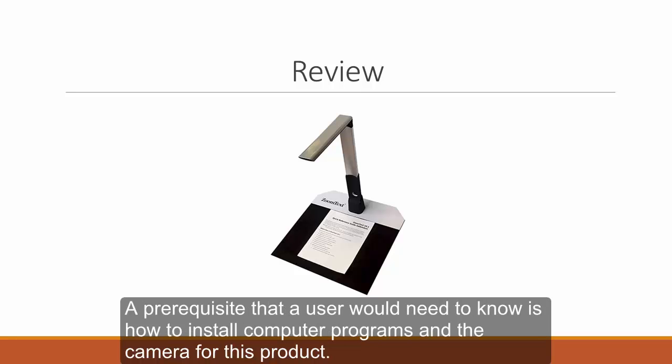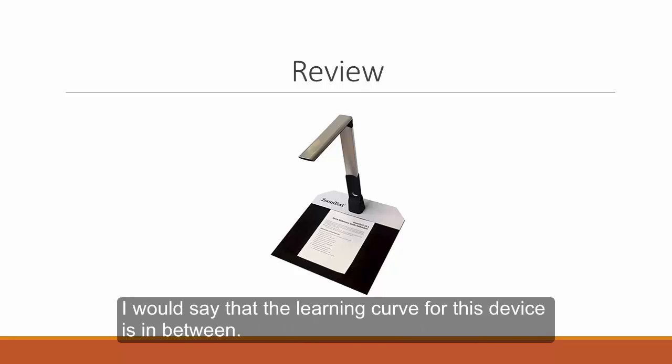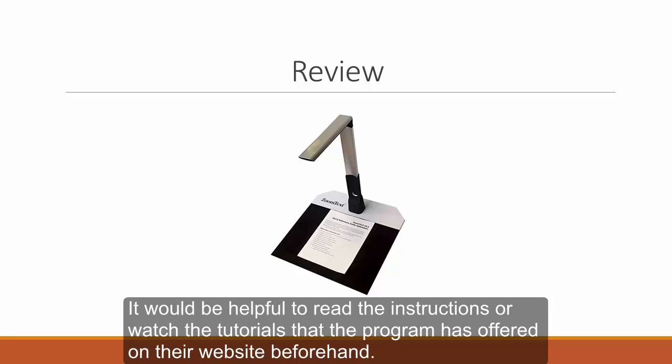A prerequisite that a user would need to know is how to install computer programs and the camera for this product. It would be useful to be somewhat familiar with computer functions prior to using this software. I would say that the learning curve for this device is in between. Once the program is all set up, it is fairly easy to navigate. The hardest part is the fact that there are two parts to it, the camera and the software for the computer. It would be helpful to read the instructions or watch the tutorials that the program has offered on their website beforehand.